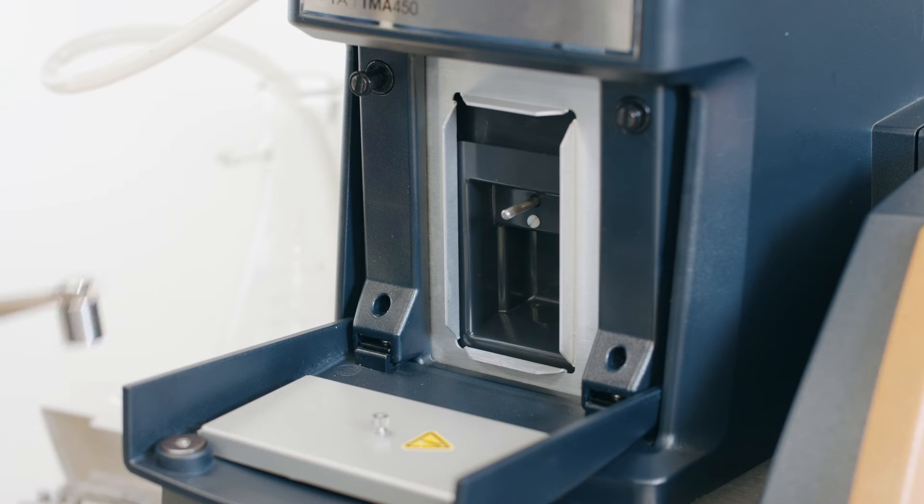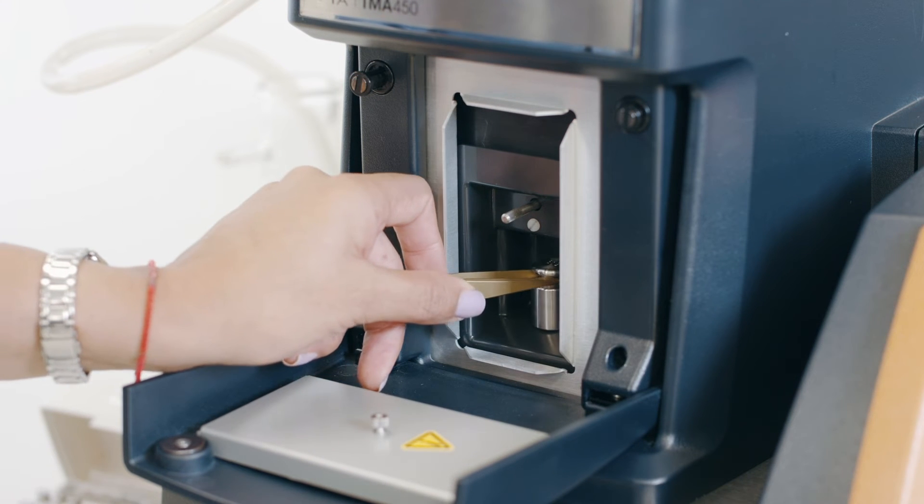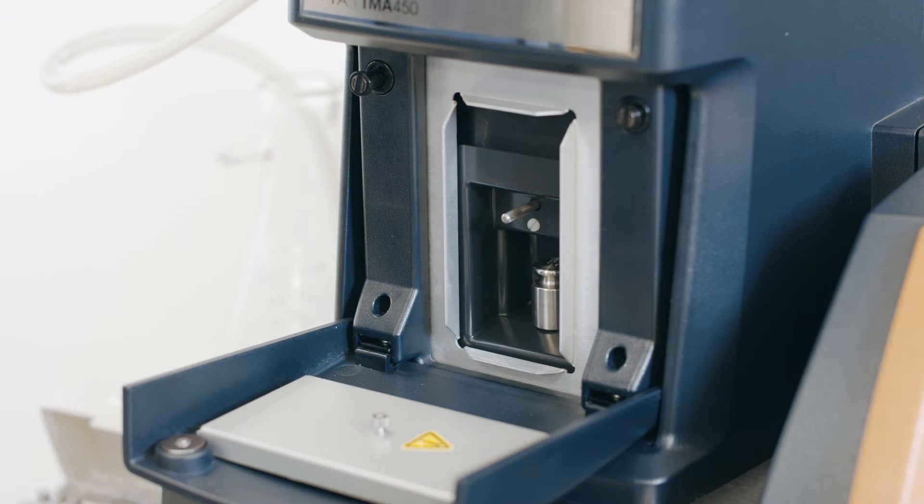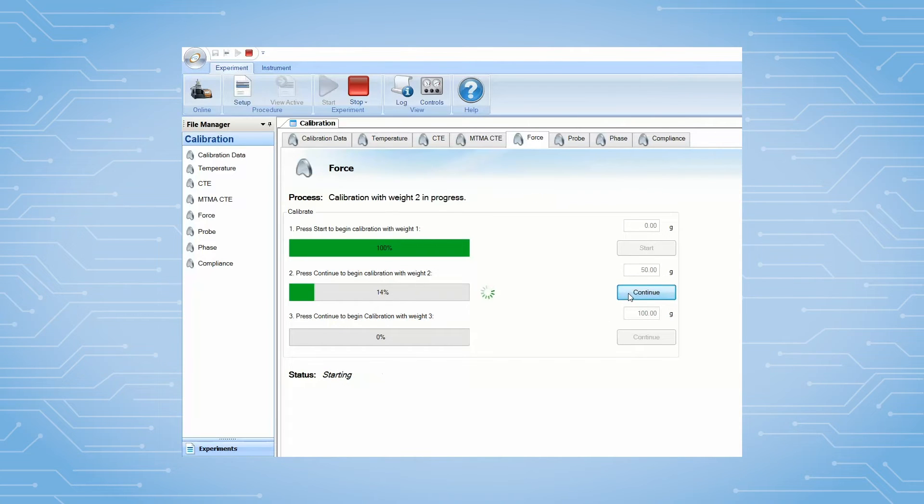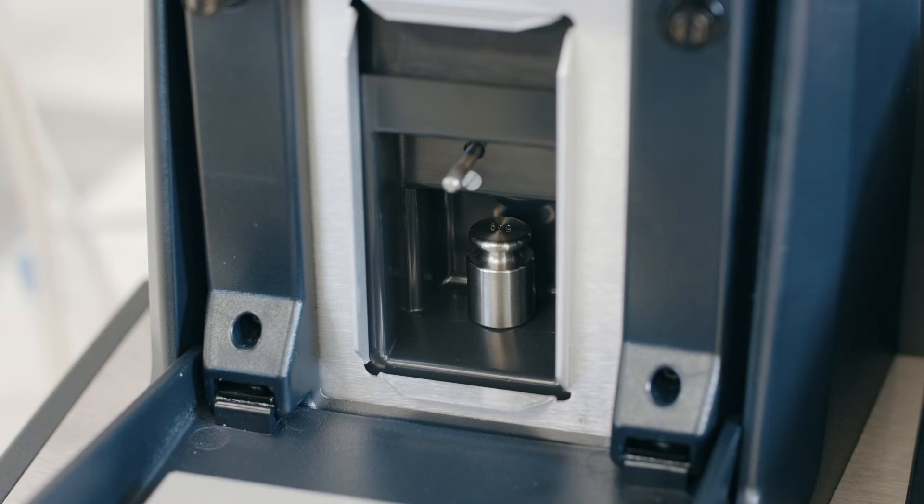When this first step is complete, place the first weight on the weight tray and click continue. You can use a different weight than the recommended one as long as it is lower than 100 grams.